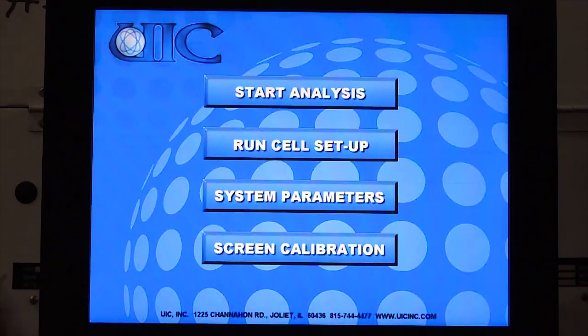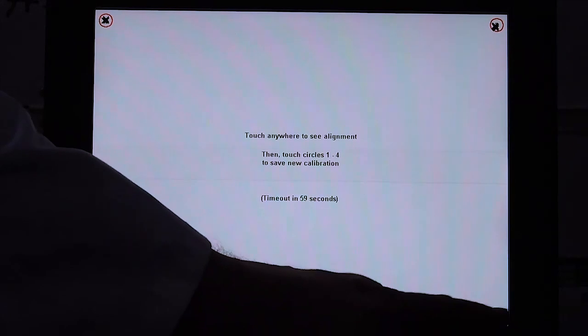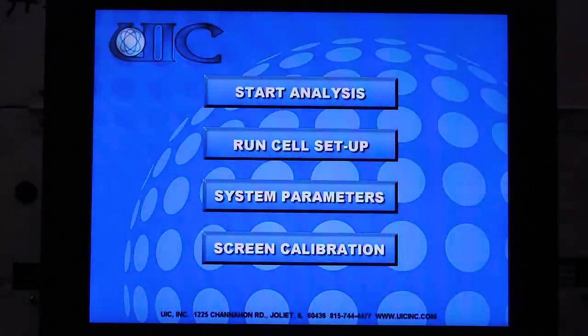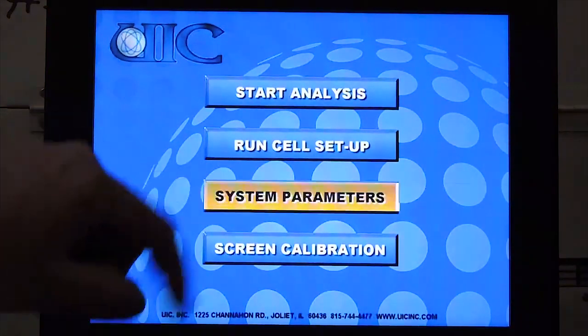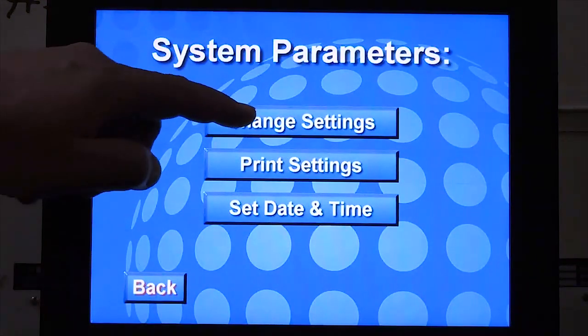We'll begin with screen calibration. Follow the instructions on the screen to calibrate. Screen calibration should only be done when users change. Select system parameters and change settings.